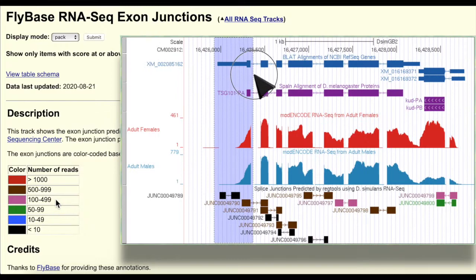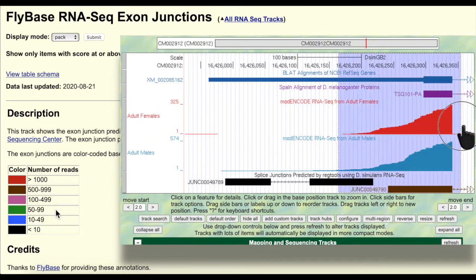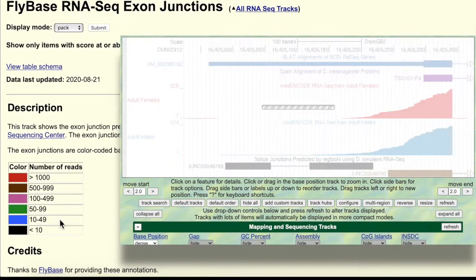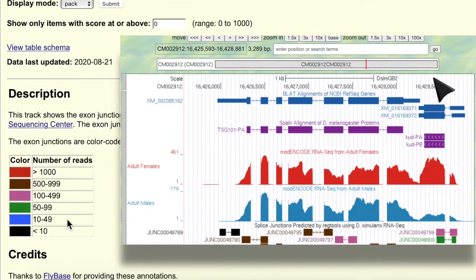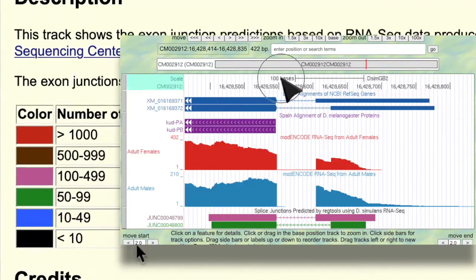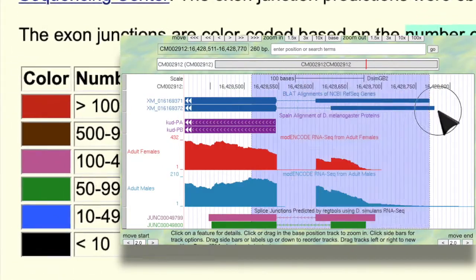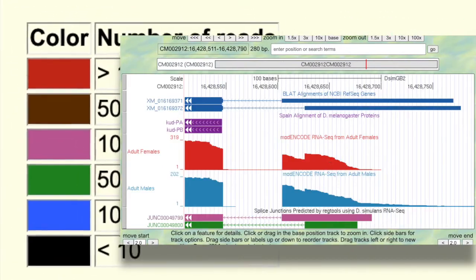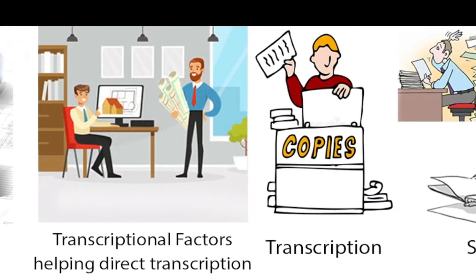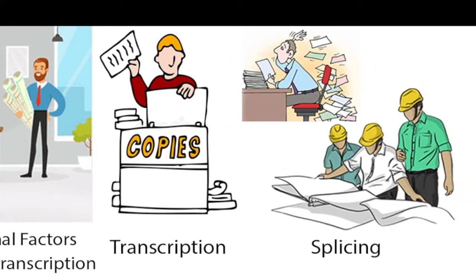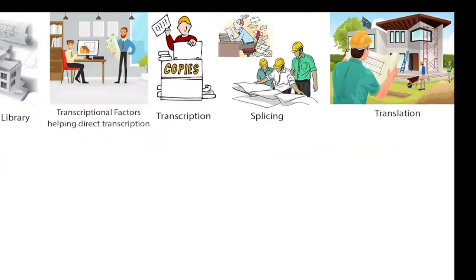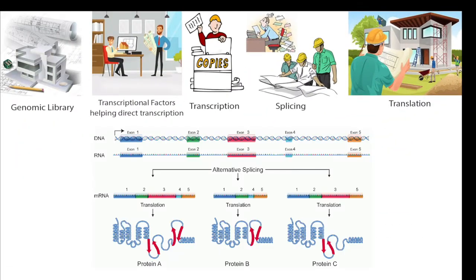The boxes of this track represent the compilation of reads that are separated by the intronic sequence present in the genomic DNA, so that they line up to where the RNA-seq reads drop straight down. With this track on, we can see different ways that this gene can get copied, cut, and pasted together to create proteins unique to the task at hand.